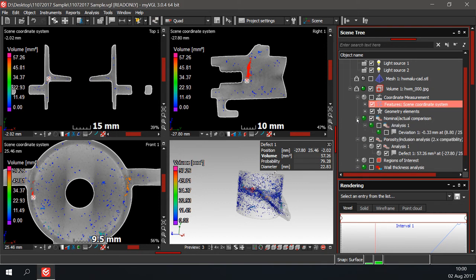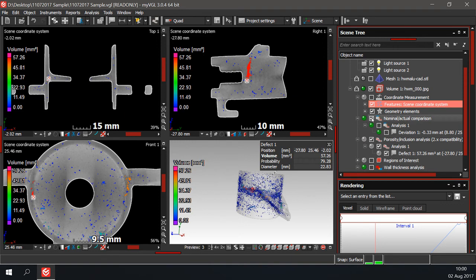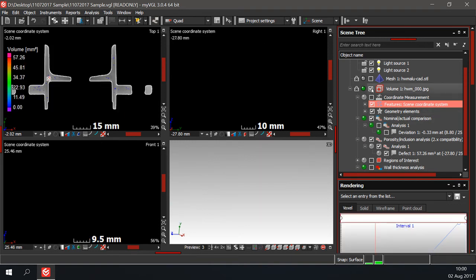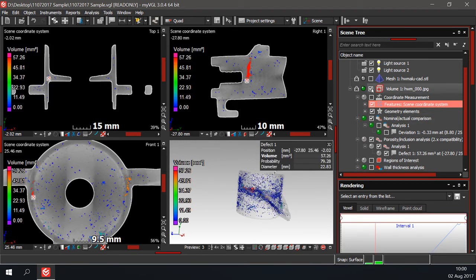Each data set and analysis can be activated and deactivated by ticking and unticking the boxes next to the item. All the information about each analysis can be found by double clicking the analysis.